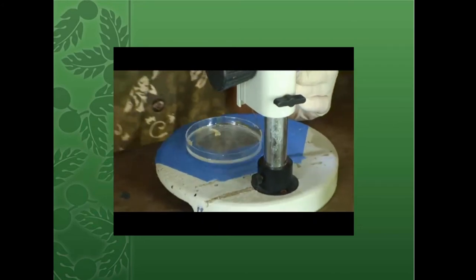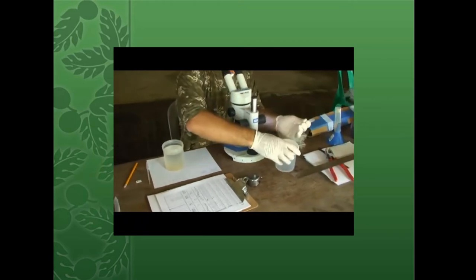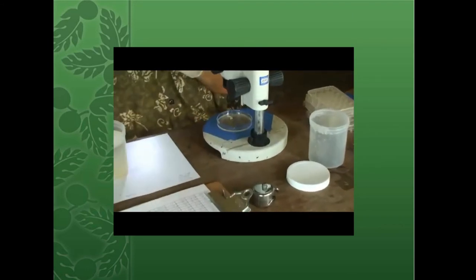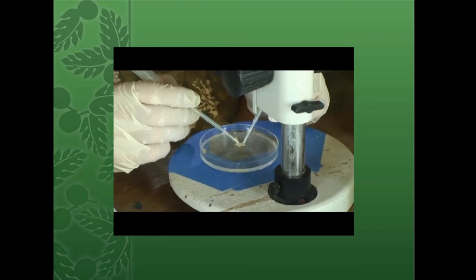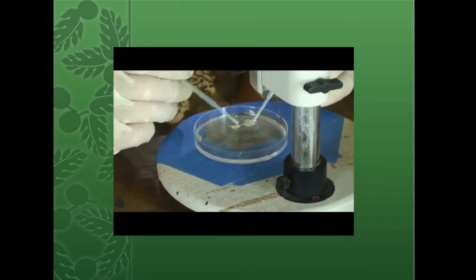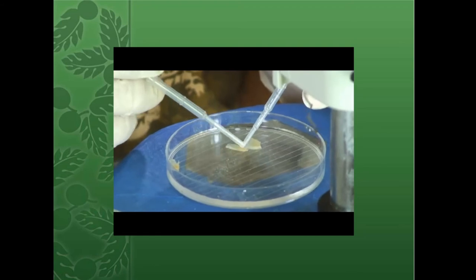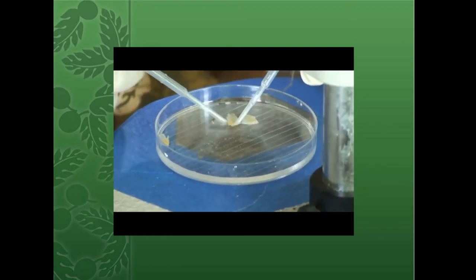I have a waste container over here that I'm going to dump everything out into. Okay, it seems like this did a really good job of getting the eggs out of the ovary subsample that we had. I'm really only seeing just a few still holding on.